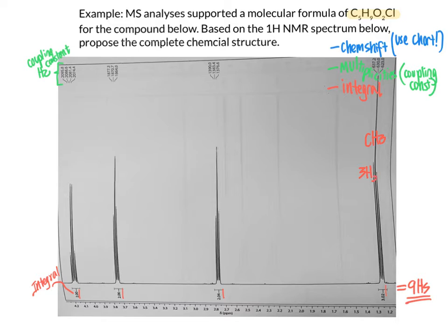And this has within it splitting of 3, meaning that this is a triplet. And we can tell it is a triplet in two ways. One, if you look closely, you can see the 3 subpeaks in here. The other is if you look up top here, you see these 3 Hertz values representing the location of each of the subpeaks within that. And so that suggests 3 subpeaks indicating a triplet. So this is a 3 hydrogen triplet we have tentatively assigned as a methyl group.